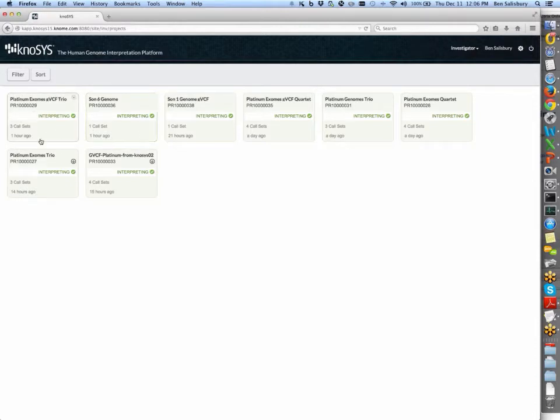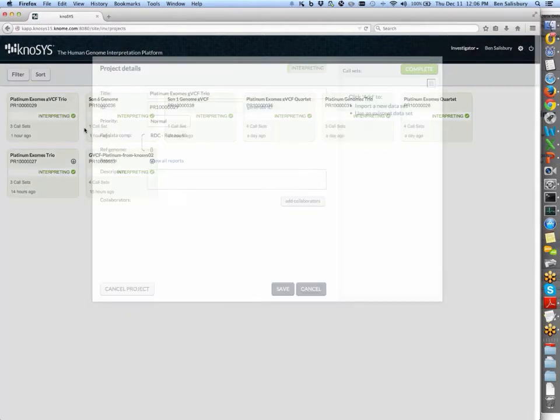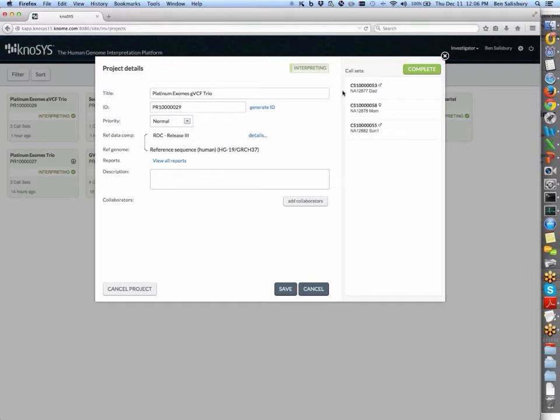I'm going to focus in on a couple of projects here. A project is a set of annotated sequences or call sets. This first one, this platinum exomes trio, includes a son, mother, and father. This is one of the Ceph families collected in Utah many years ago.